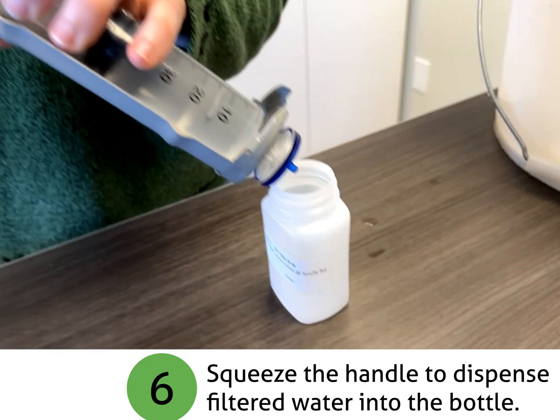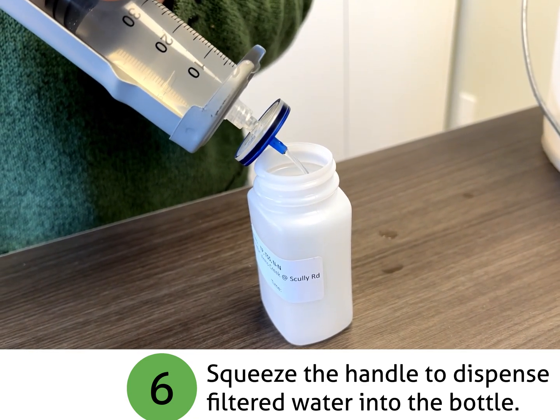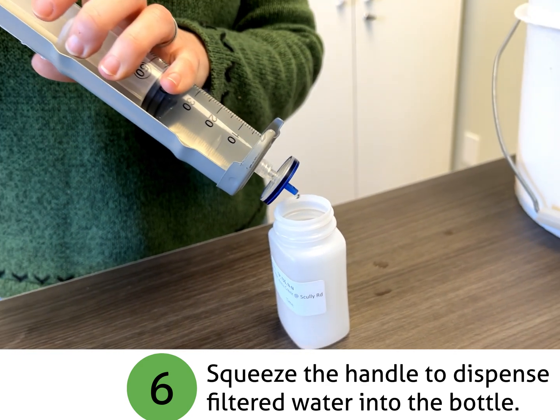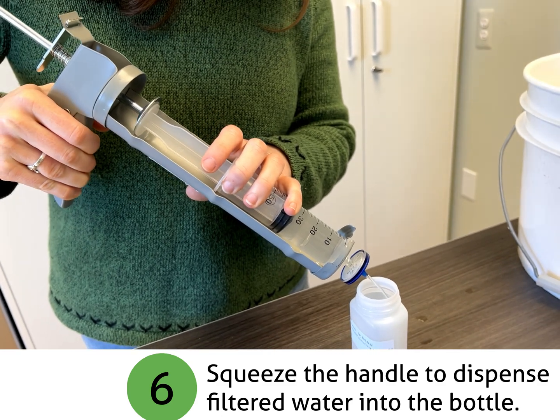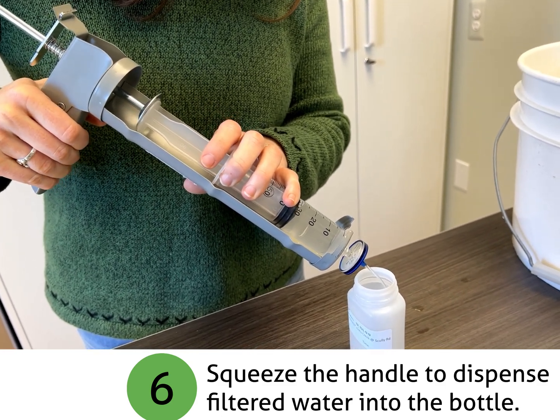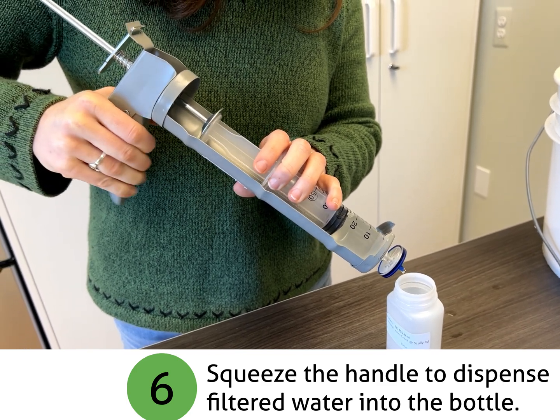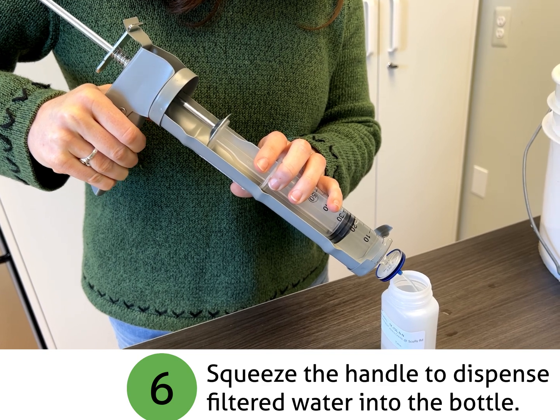Finally, filter the water by squeezing the handle of the caulk gun and dispensing the filtered water into the provided bottle. At this point, you will only have enough water to fill the bottle half full. You will need to repeat steps 2, 3, 5, and 6 until the bottle is full or has at least 100 ml in it.